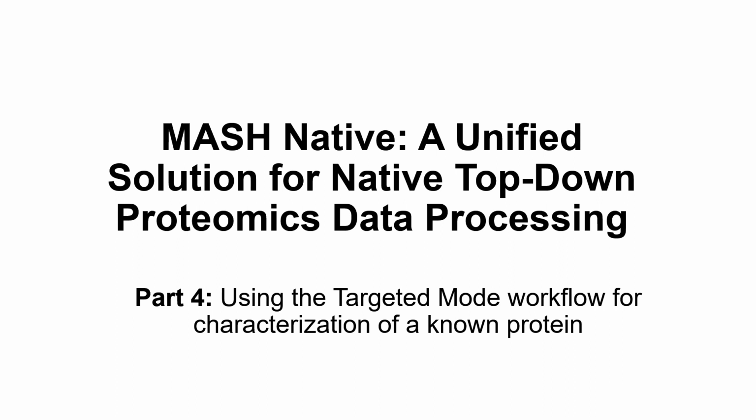The targeted mode workflow is intended for characterization of a known protein. In this short video tutorial, we will walk through tutorial number 3, analysis of mass spectrometry data collected under native conditions for the characterization of hemoglobin, using a targeted mode workflow. Please pause this video and download the native mode tutorial folder to your computer and save it to a new local folder as described in the Getting Started guide if you have not done so already.